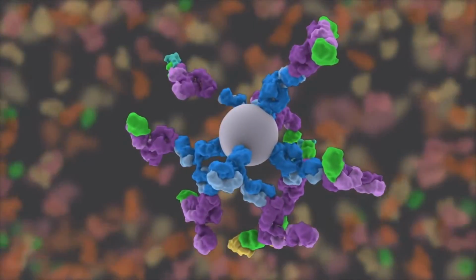Now, on to the scanning. Voila! The process is complete. Now we analyze to determine the specific proteins present and in what amounts by the fluorescence measured.